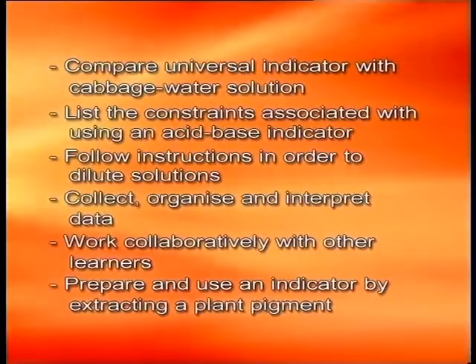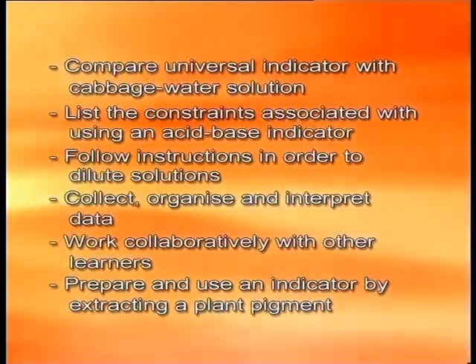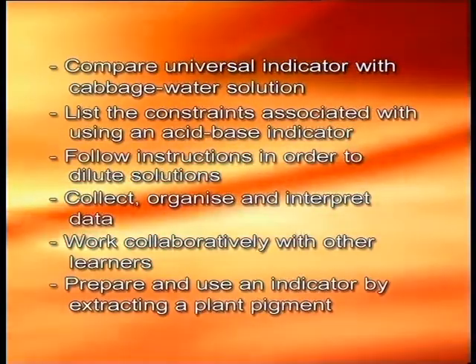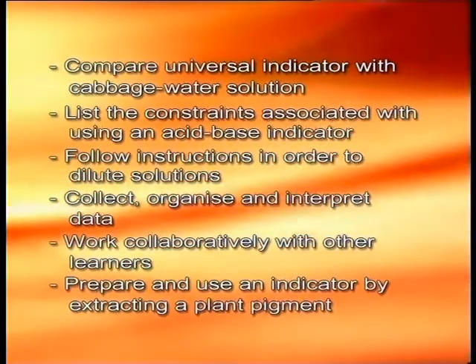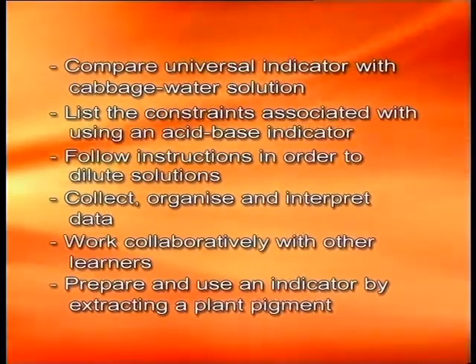Compare universal indicator with cabbage-water solution, list the constraints associated with using an acid-base indicator, follow instructions in order to dilute solutions, collect, organize and interpret data, work collaboratively with other learners, and prepare and use an indicator by extracting a plant pigment.